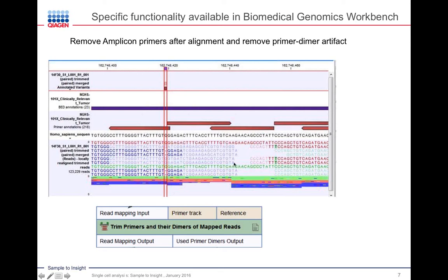And when you're looking at the reads below, you can now see those reads that are in the reverse orientation, those reads that are in the forward orientation, and you can also see paired end reads. So here we're seeing one side of a paired end read, and you can see that part of the paired end read, which includes this shaded area, and this shaded area maps to these primer regions. So you can tell that the primer region here is included in the mapping, so you get the greater specificity of the read mapping, but is not included in the variant calling.